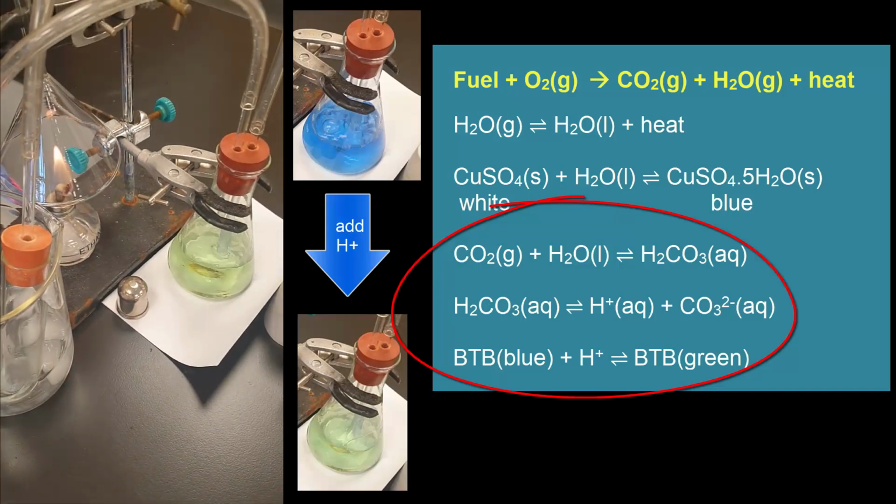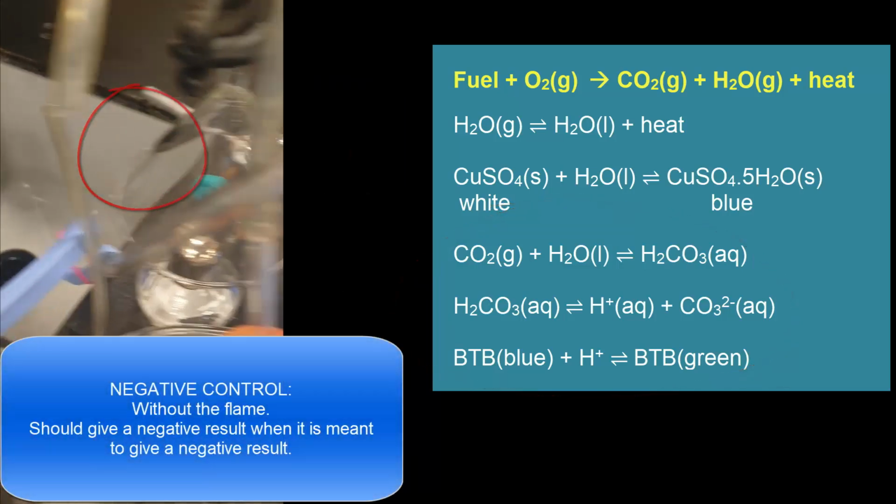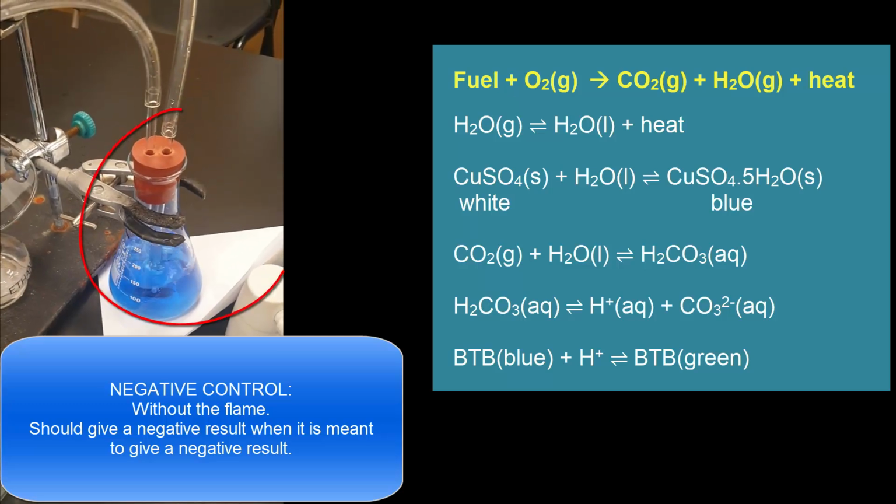As I said before, the carbon dioxide mixes with the water to make an acid. The release of the acid then causes the bromothymol blue to go from blue to green, and then finally there is carbon dioxide and water in air.